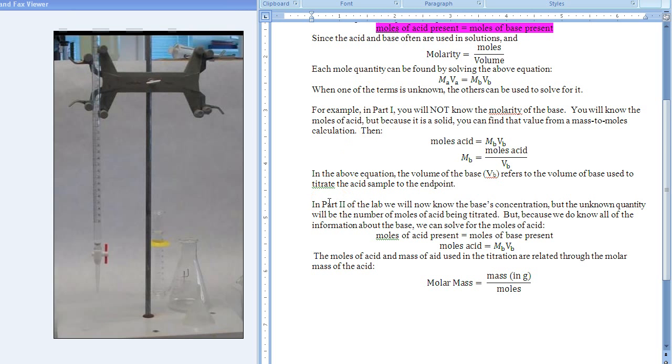So we're going to do this with benzoic acid, and because we can look up the formula of benzoic acid in our laboratory manual, or you could find it online anywhere, you'll easily be able to calculate a percent error and decide how accurate this method is. So at the end point of your benzoic acid with sodium hydroxide titration, once again it's true that the moles of benzoic acid are equal to the moles of sodium hydroxide.